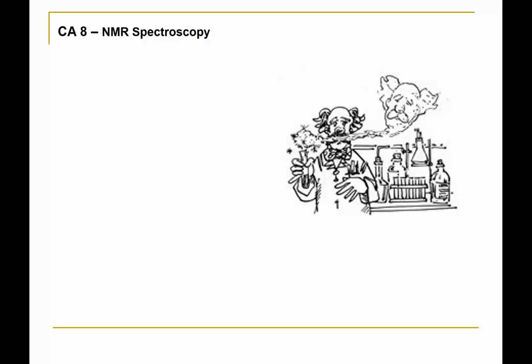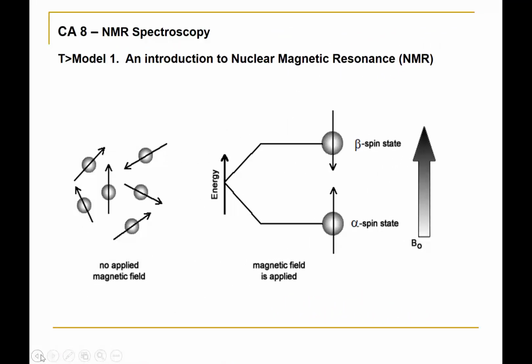We will focus mainly on proton NMR, but one could also look at C13 NMR and phosphorus 31 NMR. We will focus mainly on simple organic compounds, but this technique has also been applied to large macromolecules such as proteins. And this technique is related to the diagnostic tool of magnetic resonance imaging. This technique involves using nuclides with an odd number of nuclear particles.